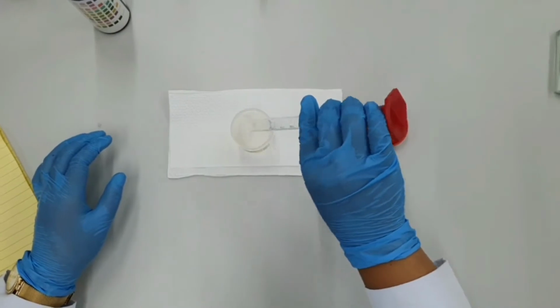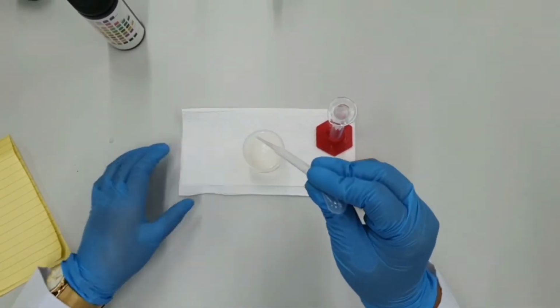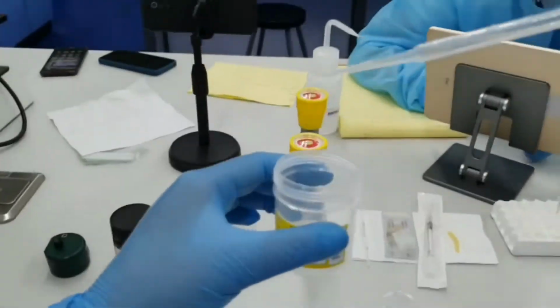Afterwards, proceed to grading the viscosity of the semen. It is graded with 0 since the sample is watery.